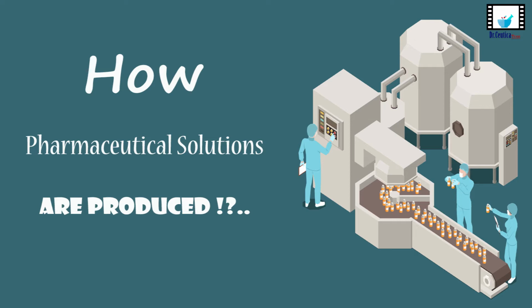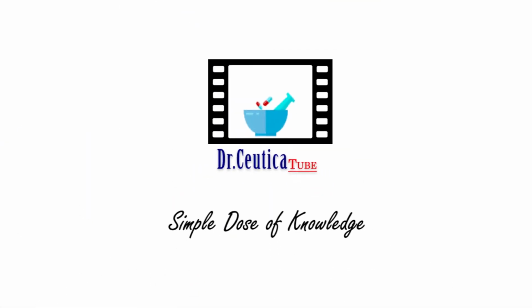Do you want to have a sneak peek into a pharmaceutical plant and see how pharmaceutical solutions are produced? We will take you there in just a moment. Here is Dr. Ceutica tube and we will give you a simple dose of knowledge.